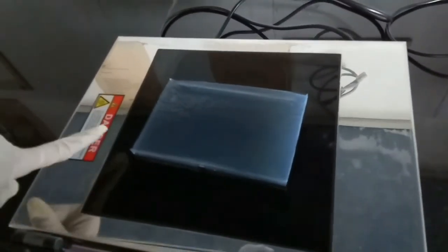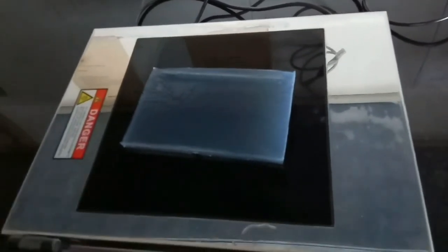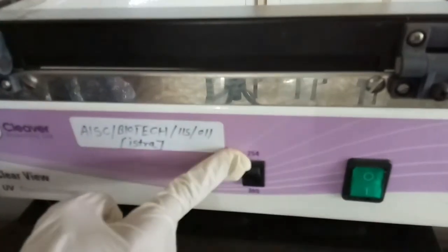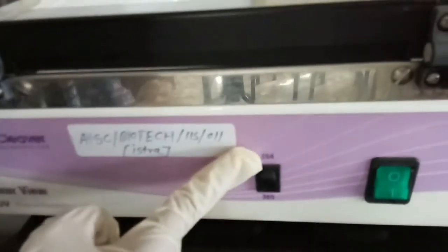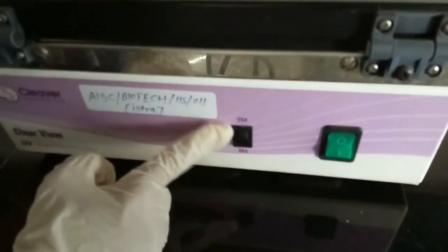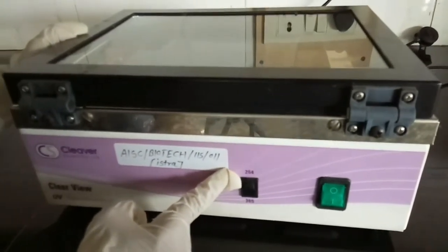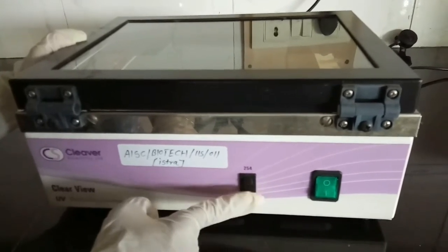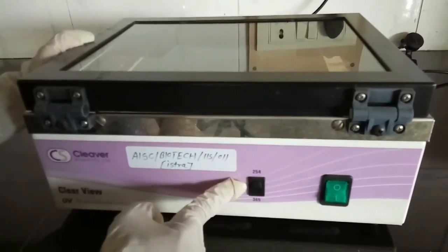We have now placed the gel on the UV transilluminator. We will close the lid. Now there are two buttons. This is the UV lamp button, and this button will adjust the wavelength. There are two wavelengths, 254 and 365 nanometer. If the bands are not seen at 254 nanometer, they can be seen at 365 nanometer. So with this button you can set the wavelength.